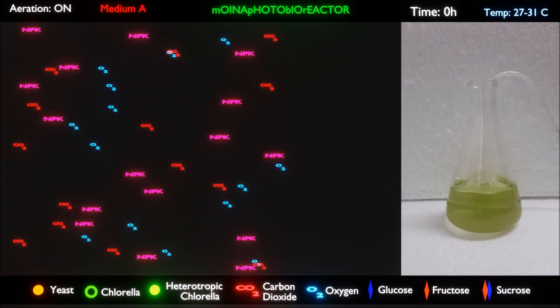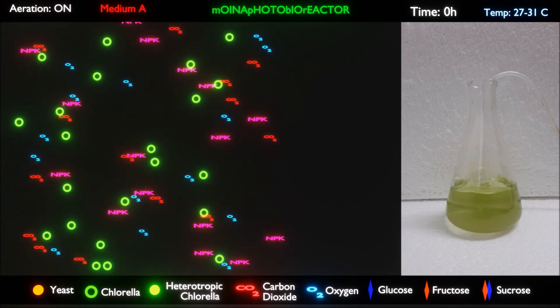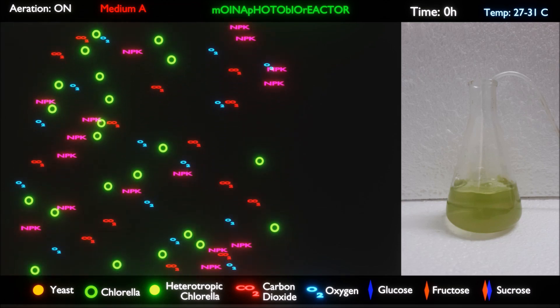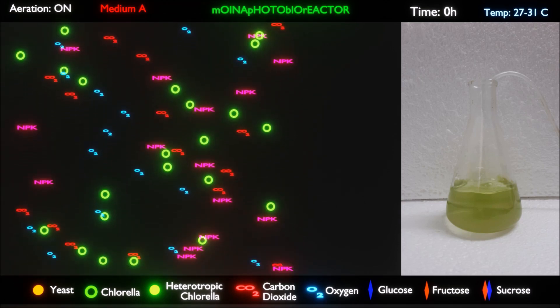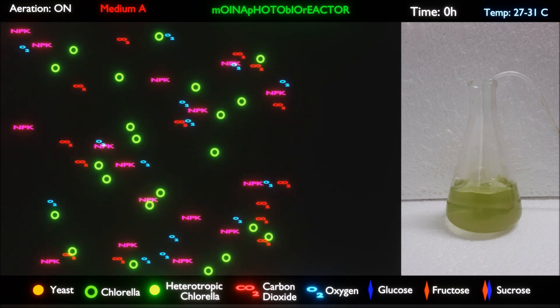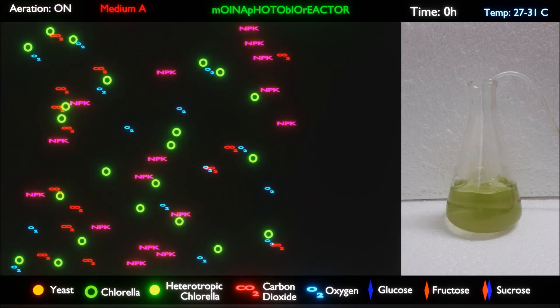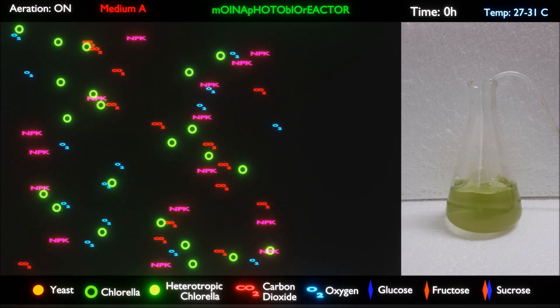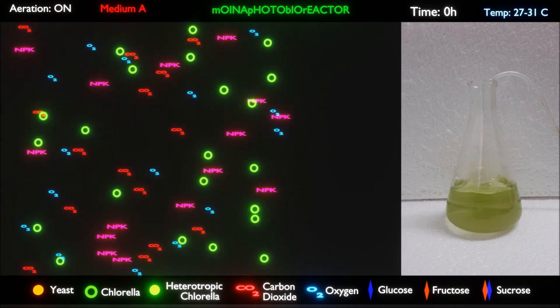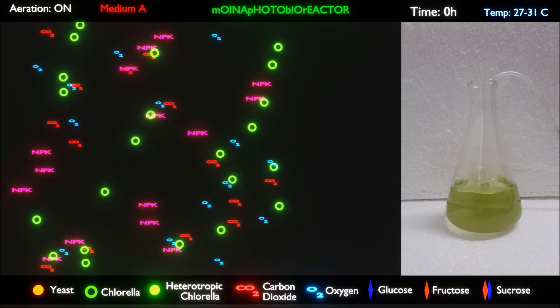The Chlorella is seeded in the aerated conical flask and allowed to propagate. The light source used is a 36-watt fluorescent lamp. In the presence of high concentration of NPK elements, only the Chlorella can propagate and any other organism is wiped out, but initially the rate of propagation is slow. It quickly catches up to the optimal rate as the Chlorella propagates and the NPK concentration decreases.